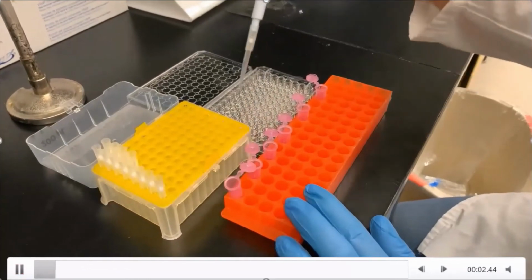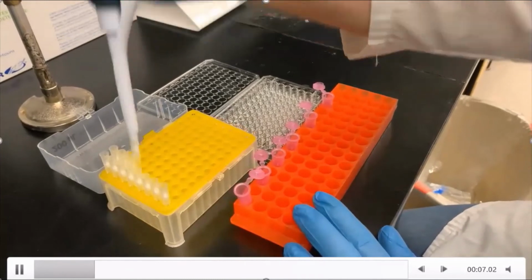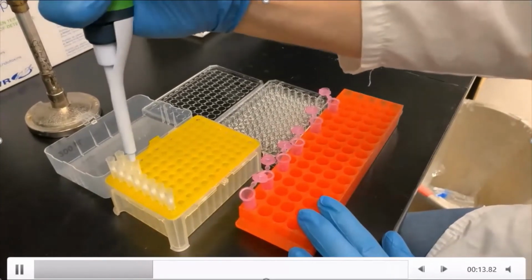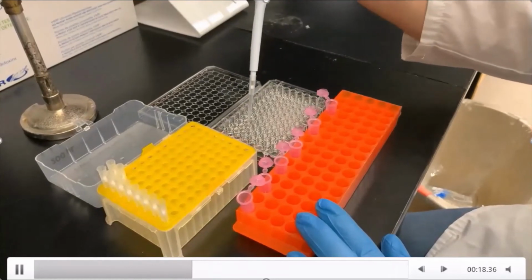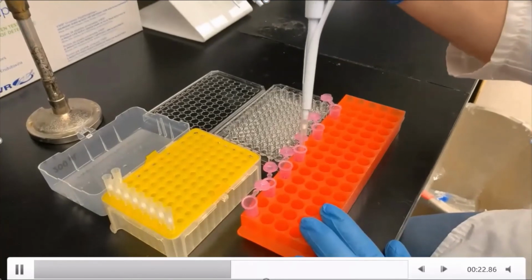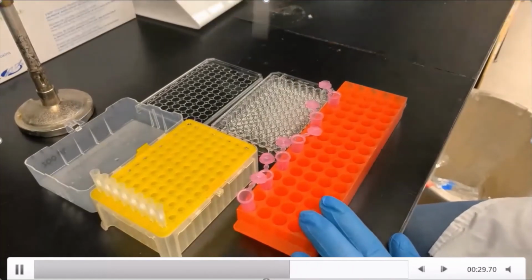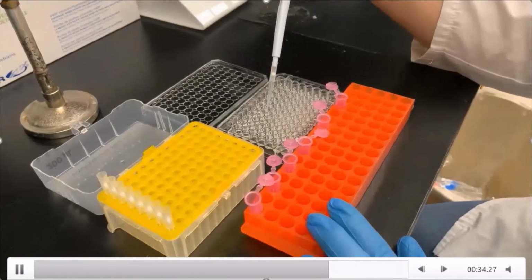So here we are adding our 3 replicates of each of our positive control, our negative control, as well as 3 replicates of the complete standard curve, and 3 replicates of each of our different therapeutics which we're testing for. It's important at this step that you don't introduce bubbles, which would interfere with the absorbance readings. You will only want to go to the first stop on your pipette. That way you're not going to be releasing air into the wells, which could introduce bubbles and interfere with your absorbance reading.